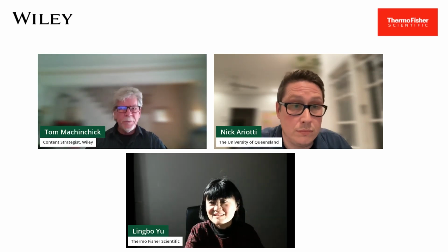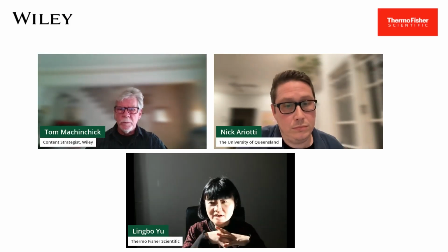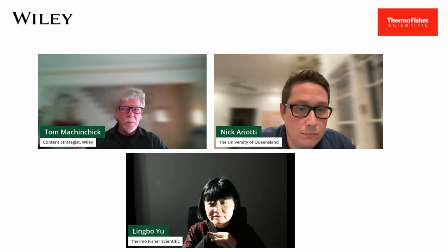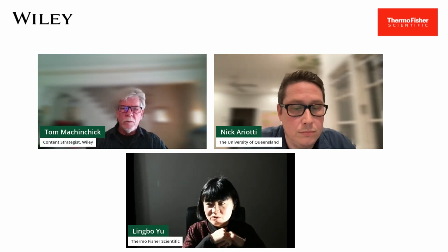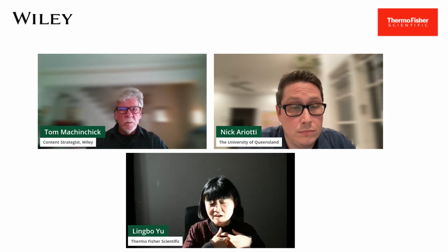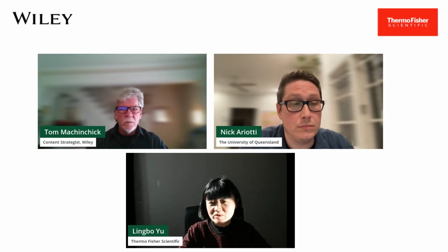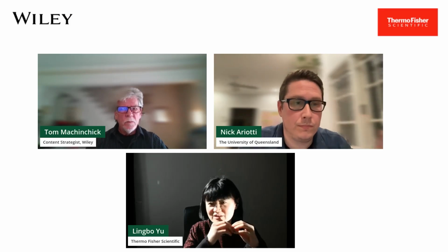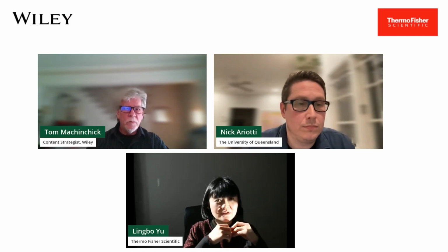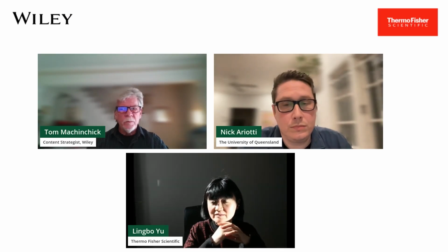Yes, you're absolutely right. On Glacios, we only have a constant power lens for the objective lens, while on Krios we have constant power lenses for everything. And you're also right that when changing the magnification, it also affects the condenser lens and the projection lens. However, the effect is much less, and that's why we chose to only use a constant power lens for the objective. Because the major image distortions, aberrations, for example coma and astigmatism, all come from the objective lens.